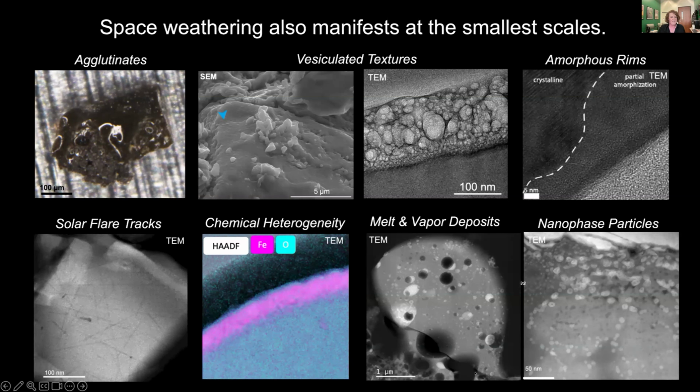And then finally, we see the development of these melt and vapor deposits on the surfaces of grains. This droplet here is produced in an impact event. And if you look at these inclusions in this high angle annular dark field image in the TEM, these are nanophase iron-bearing particles that are produced in these impact events on the surface of these airless bodies. And these are our culprits. This is what's changing the optical and spectral characteristics of the material that we can observe in the laboratory.